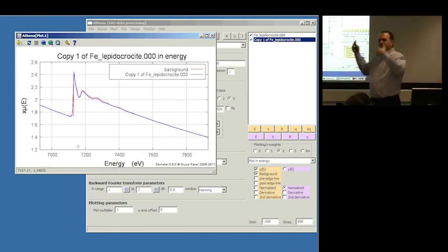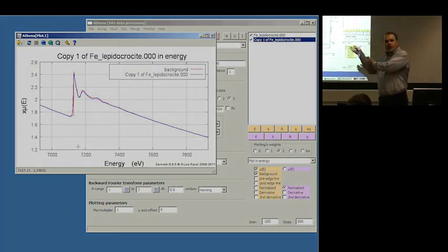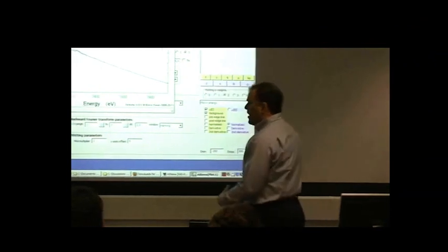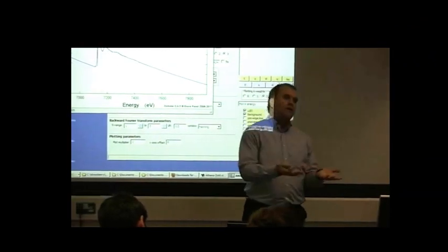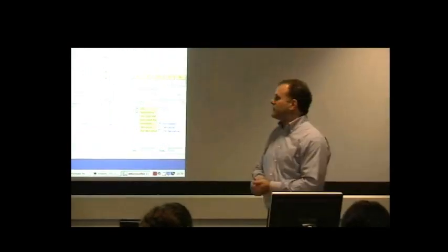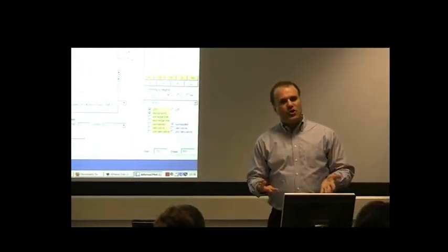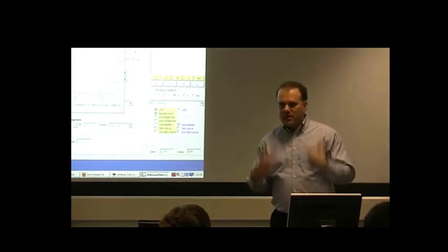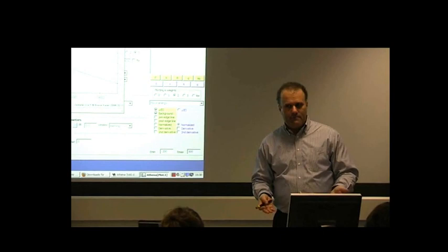That is, the spline now has Fourier components in it that we associate with the data. So the more complete answer to how you choose the value of RBKG is big enough to do a good job of removing the low frequency stuff, but not so big that you damage the data.